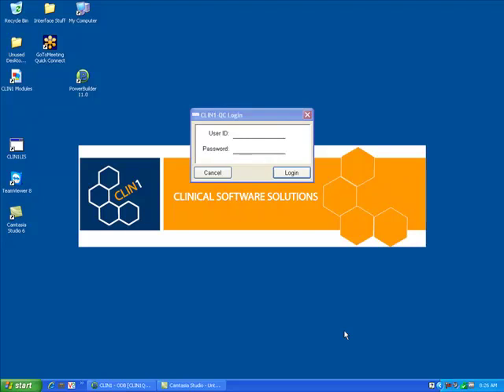Good morning. Today we're going to do a quick overview of CLIN1QC by Clinical Software Solutions. CLIN1QC is a standalone quality control program for use in clinical laboratories and other clinical settings. It can also serve a statistical process control function. It is a multi-user application.